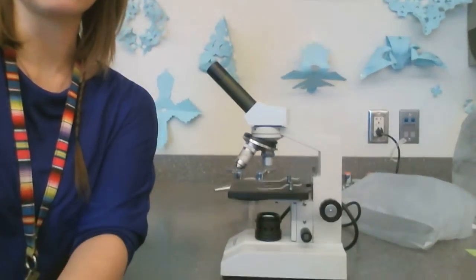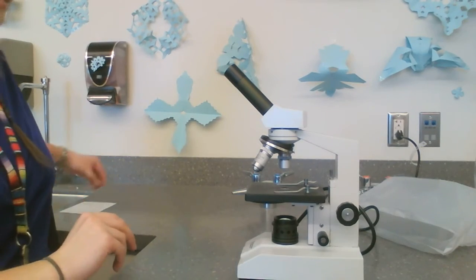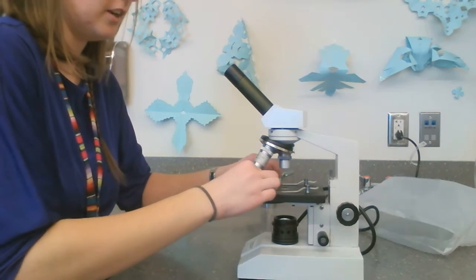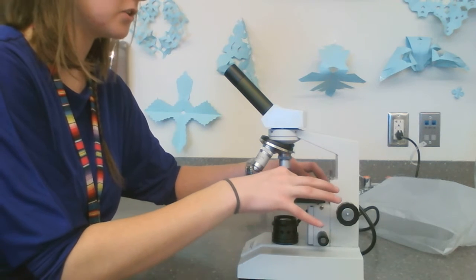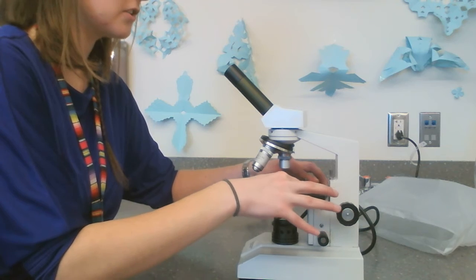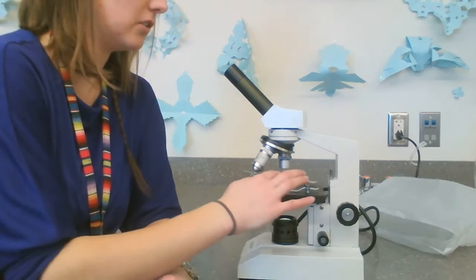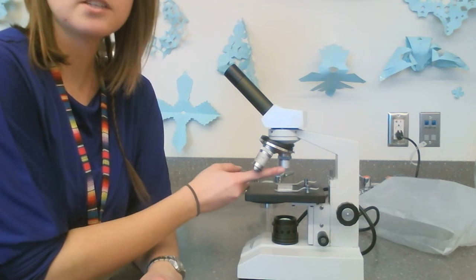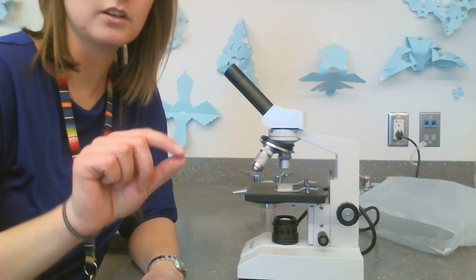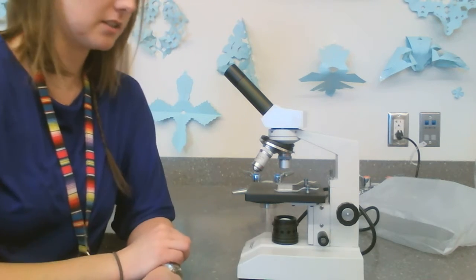All right, just as a review for how to use the microscope, here we've got our microscope. You're going to have an unlabeled slide that you need to put on there. Remember to push on the back of the stage clips to lift them up so you don't damage the slide. Adjust your slide so that the specimen is about in the middle of the dot. Remember, you should always start on the lowest power objective. That's the shortest one. The longer it is, the higher power it is. But we always start on the lowest power objective, okay?